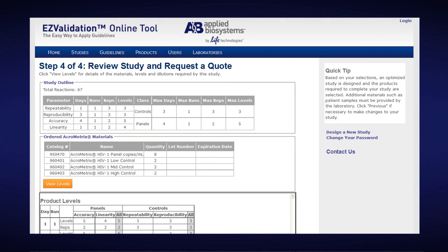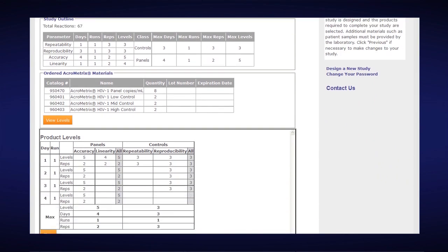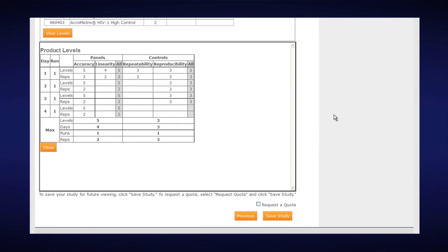That's the first four easy steps. If you choose, you can save your study by clicking on Save Study. If you would like a Life Technologies representative to get in contact with you, you would click on Request a Quote and then Save a Study.